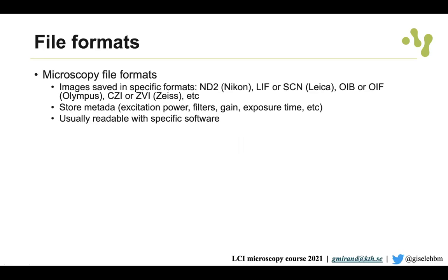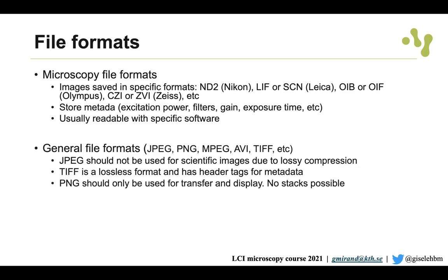About file formats, it's good to keep in mind that we have the microscopy file formats. So for instance, we have ND2 for Nikon or CZI for Zeiss, and usually they are readable with specific software, but we have libraries, for instance, in Fiji that allow us to read these formats. And we also have general file formats.